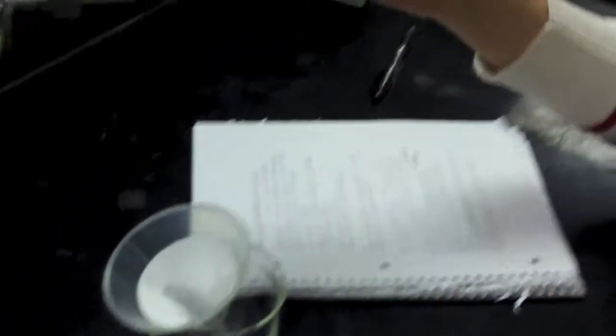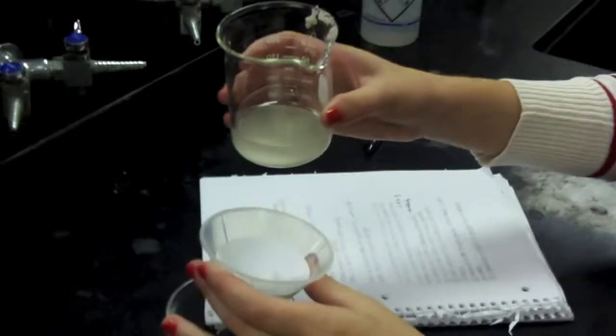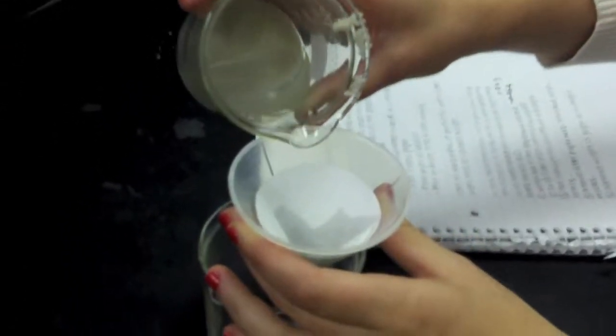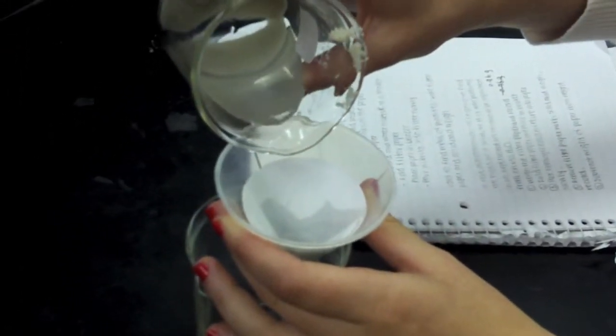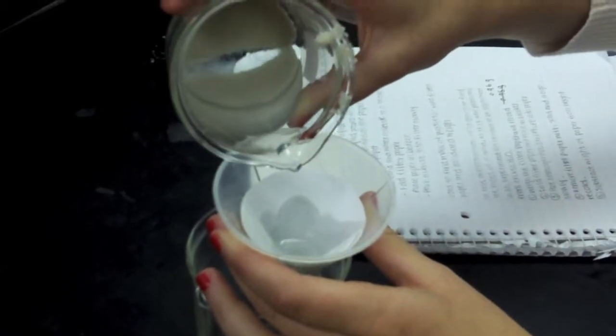Now it's time to actually pour your heterogeneous mixture into the funnel and filter paper. Slowly, so that it doesn't overflow or anything, pour the mixture in.